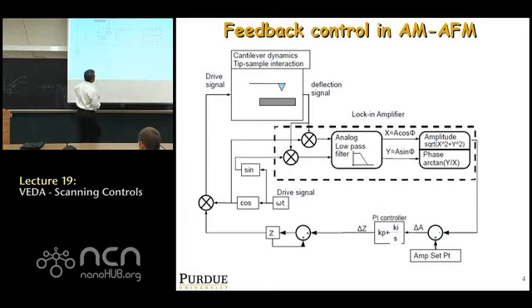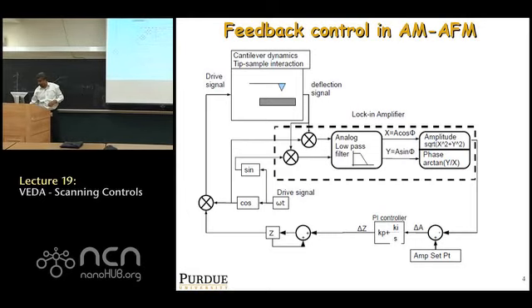And then, as the amplitude comes out, it is compared with the set point amplitude that you set for the image, right? It looks at the difference between the actual amplitude being measured at that point in the sample and the desired set point amplitude. Any difference, delta A, is the error signal that feeds into this controller, which has Kp and Ki, which then changes Z and keeps checking to make sure the error signal goes to 0, basically. It moves Z so as to keep the error signal 0. Okay? This is the basic overall arrangement of the feedback control in tapping mode AFM.